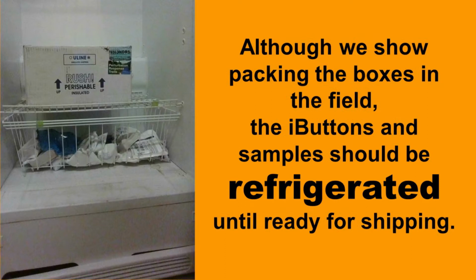It is critical you follow the instructions for the USDA APHIS permit. If your site is USDA APHIS regulated, a copy of the receiving permit will be included in your kit in a plastic sleeve ready for return shipping. The permit will need to be adhered to the outside of the box along with the pre-filled shipping label. If you have any questions at all, contact Amy.